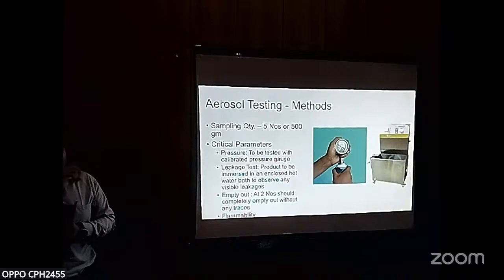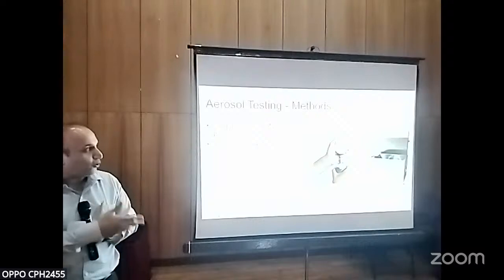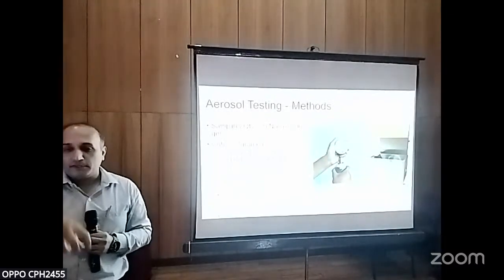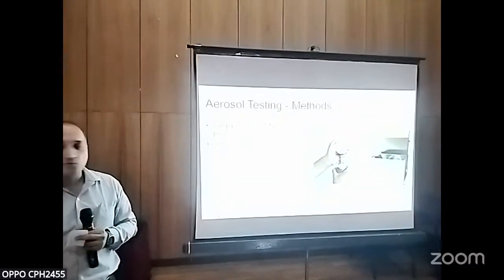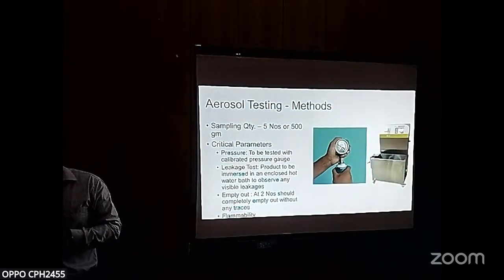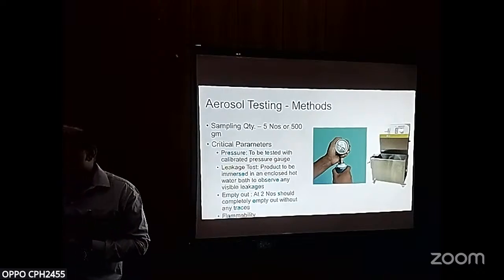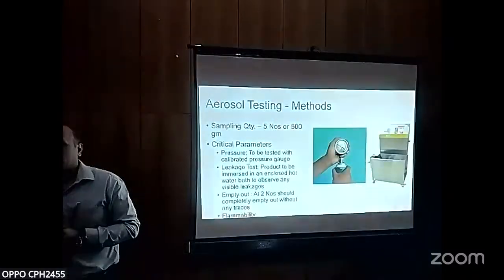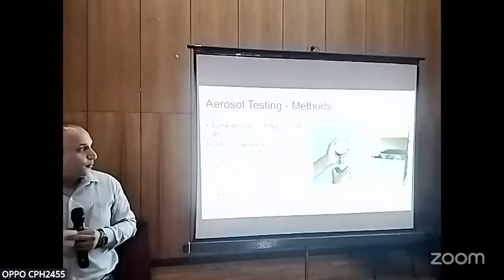And this is a leak testing apparatus. For leak testing, you don't have to fabricate anything. You can have a big drum with hot water, immerse the entire container, and see whether any bubbles are coming out from the seals or anywhere else, the same way you check a puncture in a tire. Leakage is a very critical parameter, because if the container leaks, there are problems which are going to happen.